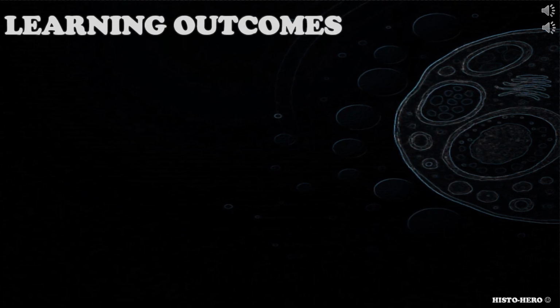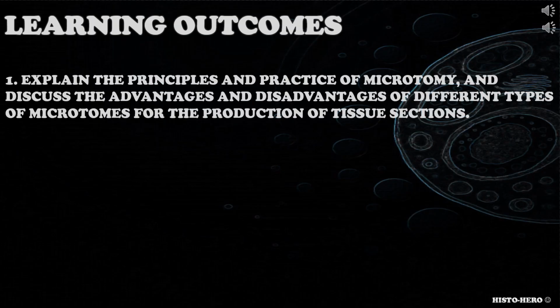The learning outcomes demonstrate candidates' knowledge, skills, and competence in this submodule. They also include demonstration of the understanding of scientific principles, laboratory procedures, quality assurance, and professional conduct. They allow candidate to work autonomously and solve problems independently. The first learning outcome is explain the principles and practice of microtomy, and discuss the advantages and disadvantages of different types of microtomes for the production of tissue sections.